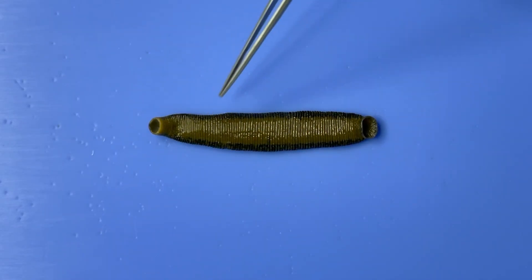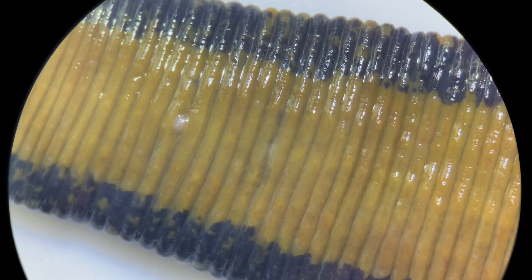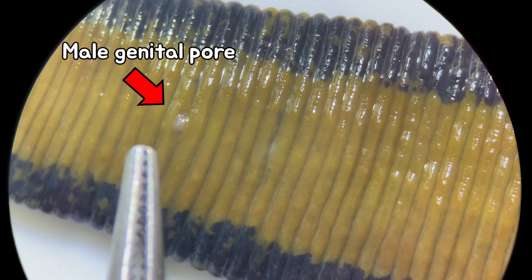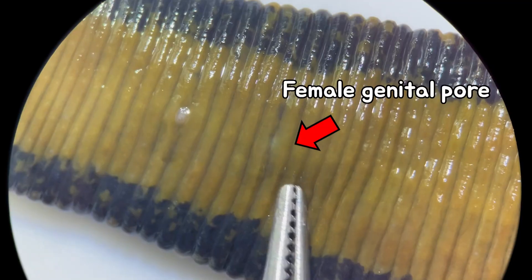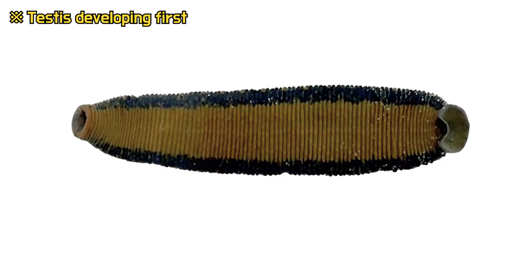If you take a closer look at the ventral side of the leech, you'll notice two distinct openings. These openings are the genital pores where reproductive cells are discharged. The one closer to the head is the male genital pore, and the one below it is the female genital pore. They're hermaphrodites.